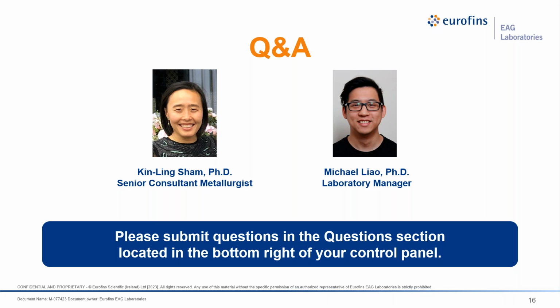So it would be best to do some research and see how we can replicate that medium in the correct pH and run the test in the appropriate condition and environment. Okay, thank you for that question.